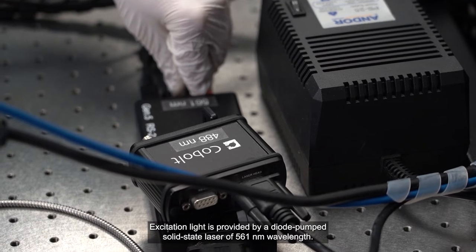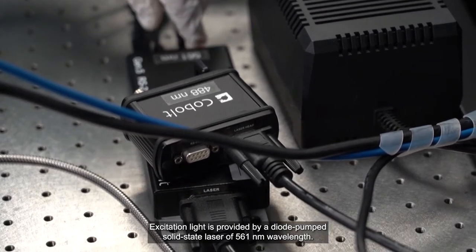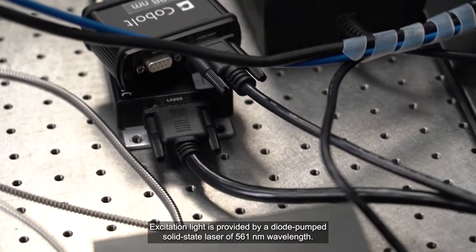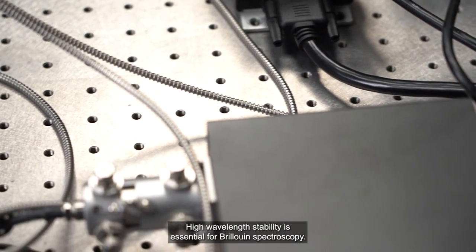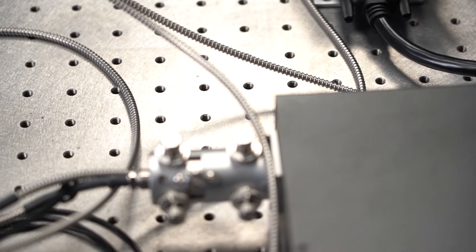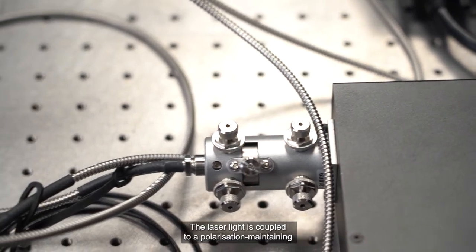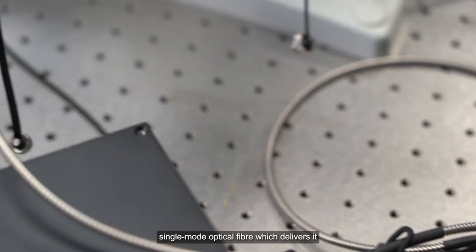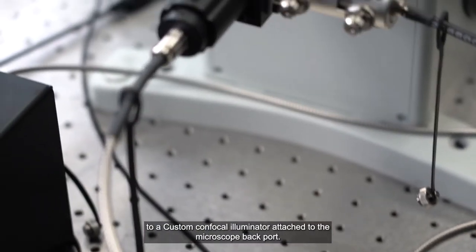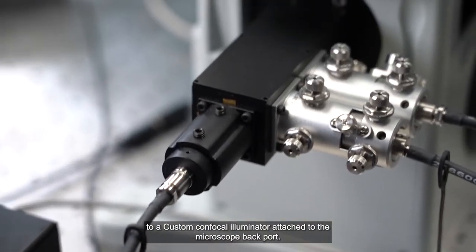Excitation light is provided by a diode-pumped solid-state laser of 561 nanometer wavelength. High wavelength stability is essential for Brillouin spectroscopy. The laser light is coupled to a polarization-maintaining single-mode fiber which delivers it to a custom confocal illuminator attached to the microscope back port.